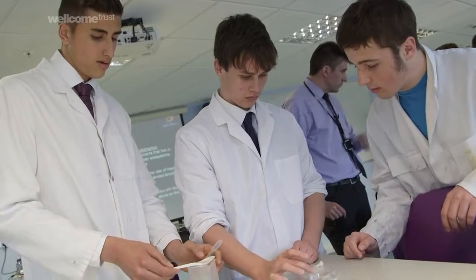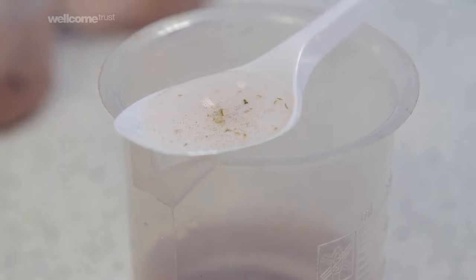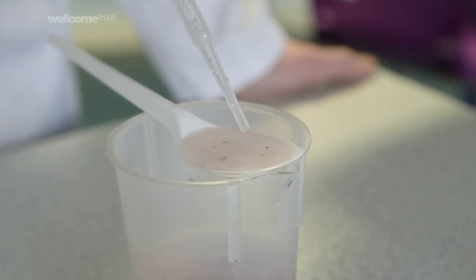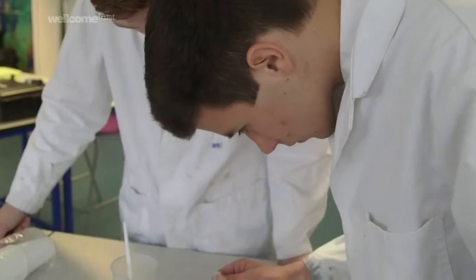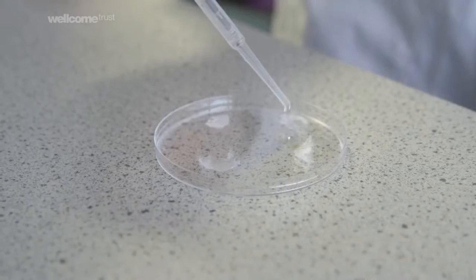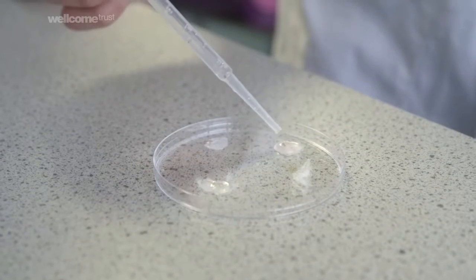So to observe Daphnia under the microscope, what you need to do, first of all, is to isolate the Daphnia just on the end of a spoon, is usually the simplest way, and suck up one of those Daphnia into a small pipette. What you then need to do is to place the Daphnia down onto some small cotton wool islands that have been pre-located on a petri dish.